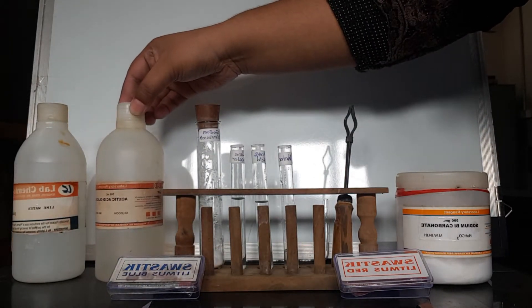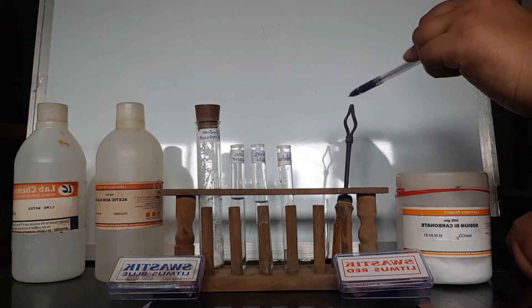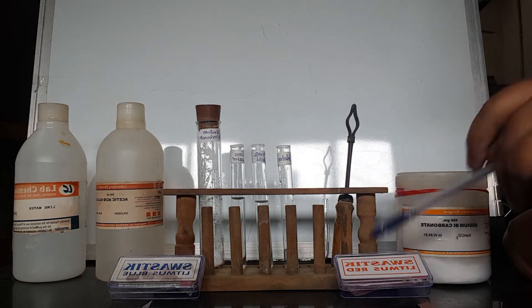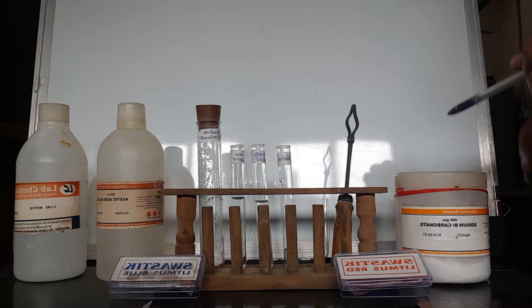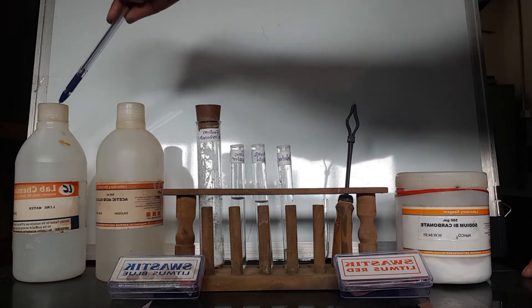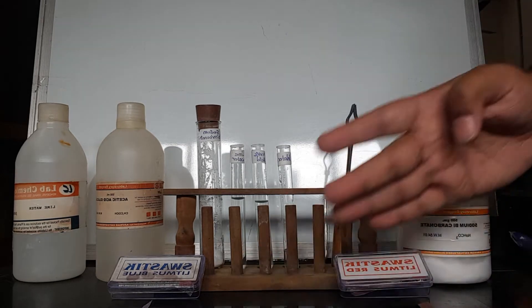The requirements for this particular practical are: test tubes, a test tube holder, a large test tube, a test tube stand, red litmus paper, blue litmus paper, sodium bicarbonate, acetic acid, lime water, and a bent tube to pass gas.